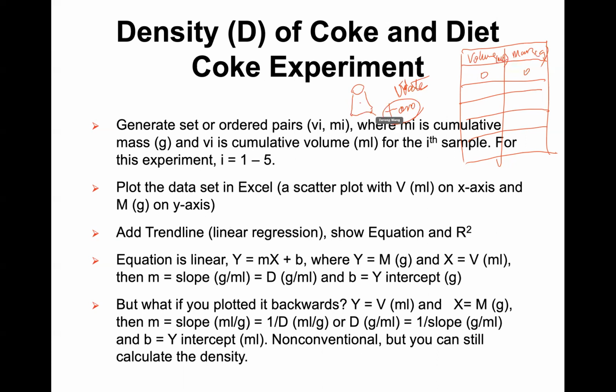So when you add the water to that, the mass you take will be the mass of water you added, right? Now in this case, you have 5, so that gives you total data points 6, including the initial 0, right? So in this case, you can use a pipette which can measure the volume accurate to 2 decimals.